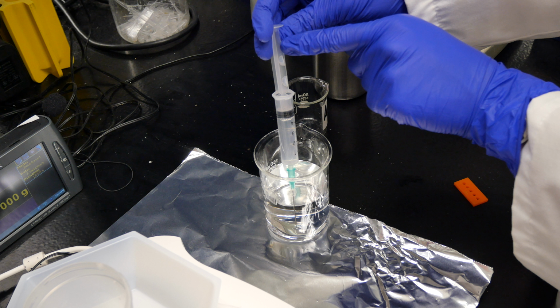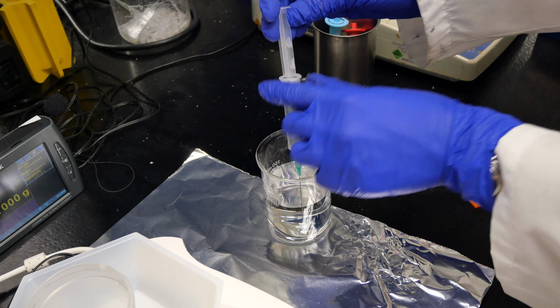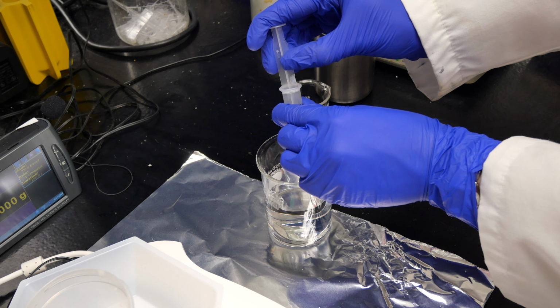When you want to use the syringe, fill it up all the way with your liquid, then close the syringe until your tactile marking reaches the syringe barrel flange.